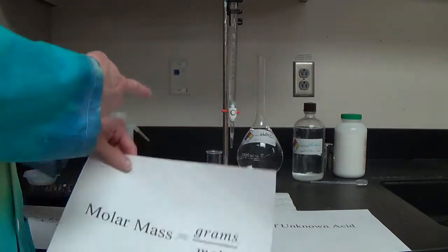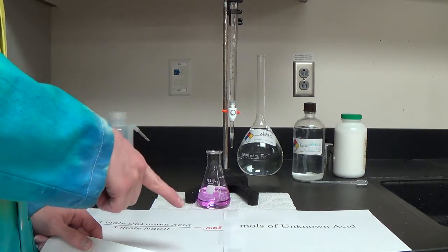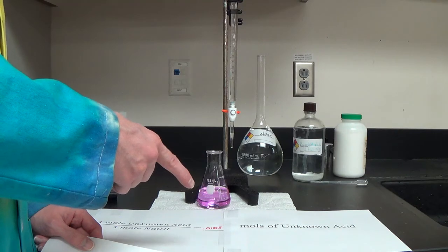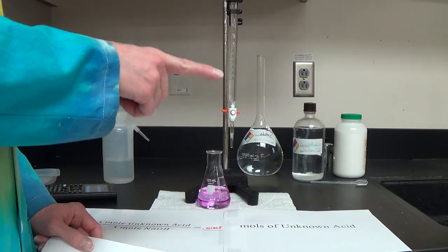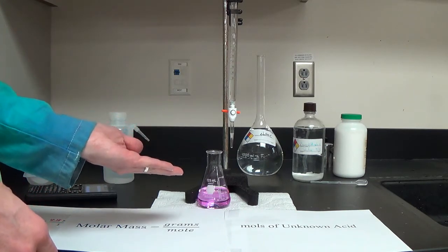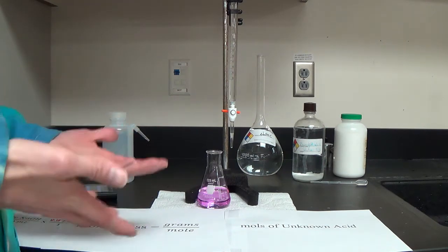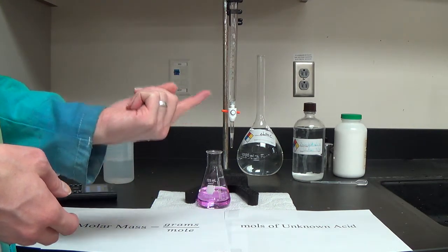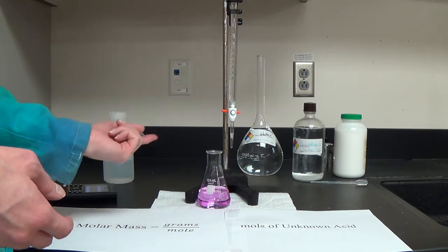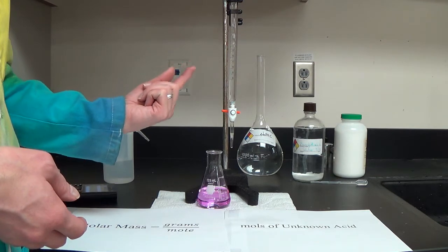Simple calculations, simple lab equipment setup. Do go a lot slower than I did. At first, you can let it stream in, but then go drop by drop so that you can get as light a pink color and as exact a measurement from your burette as possible. How do I clean this up? I will rinse out the burette and dump any extra sodium hydroxide down the drain — it is safe to go down the drain especially at one molar or less. The neutralized solution should be very close to neutral, so everything goes down the drain, and you rinse with water.